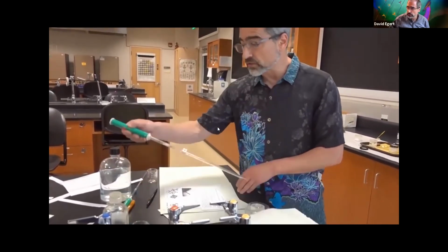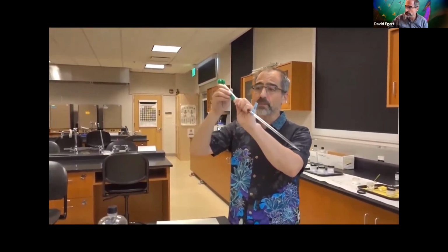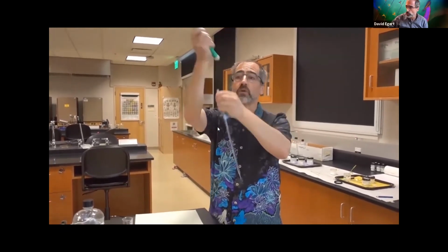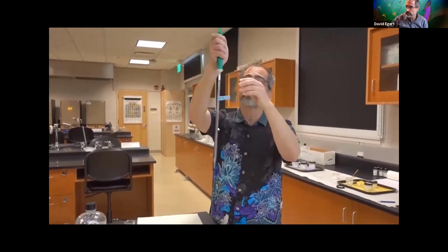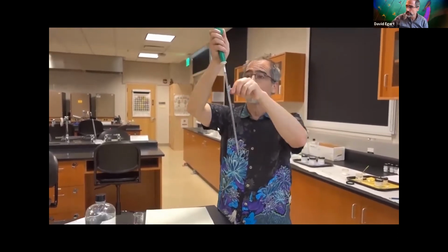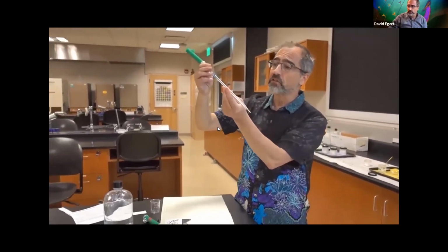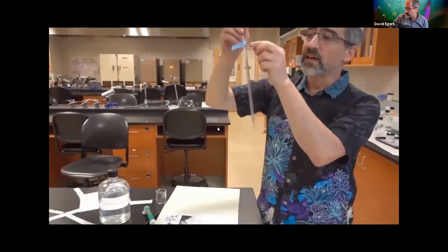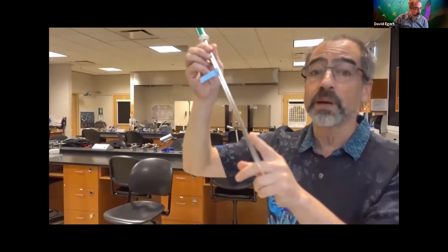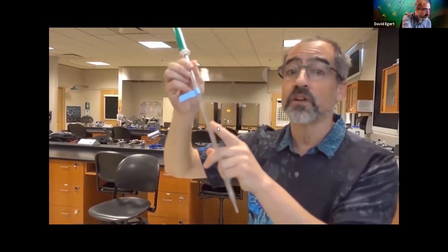To measure out the distilled water, I'm going to use a pipette. These pipettes are for much more accurate volume measurements. And you always want to use one of these little pipetter attachments here, which basically sucks up. You don't want to ever use your mouth pipette because you might get something inside you don't want. These are a little confusing for people at first. They come in different volumes. This one here is a 5 ml pipette, and it's designed to dispense volumes up to 5 milliliters.